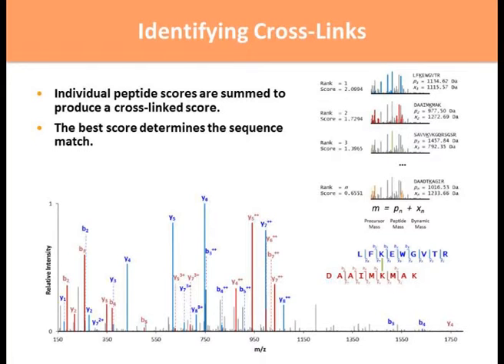It turns out that in the end, the 2 peptides that sum together to equal the precursor mass are often amongst the top 10 in rank, usually the first 2 in rank, meaning that each individual peptide would easily provide adequate explanation for approximately half of the spectrum that is observed. And so the whole process actually becomes very quick and accurate.